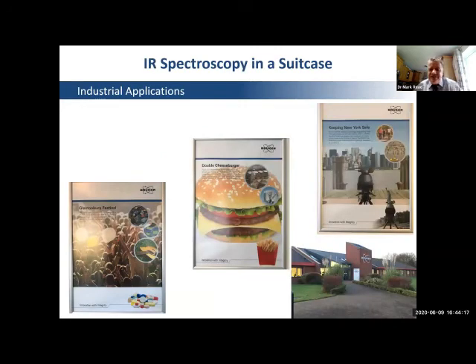In fact, this instrument is produced by Bruker. Up here in the Midlands, they have an office in Coventry. I'm walking down the corridor. It's interesting, they have some posters advertising the use for their spectrometer. I mentioned compound identification, quality control. Also, the food industry uses it. They want a consistent product, so it's used on the food production line.